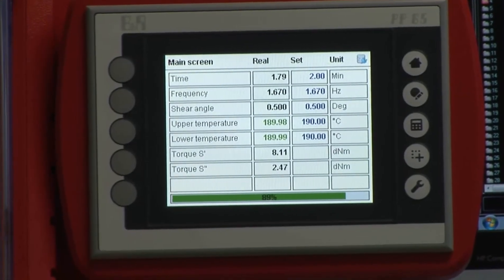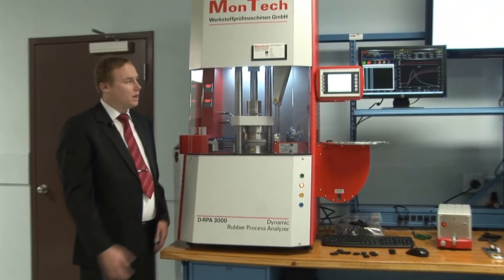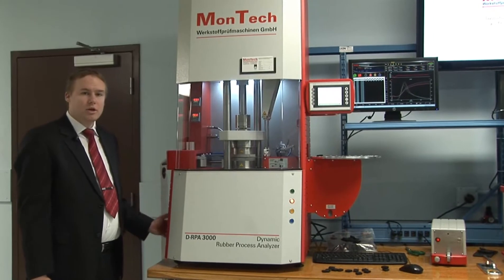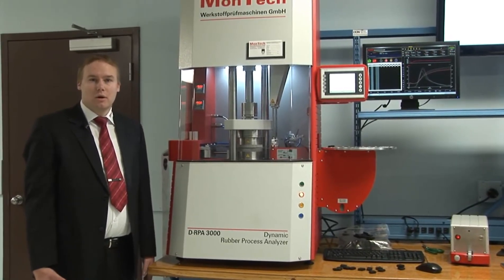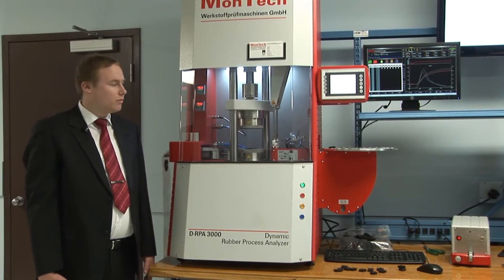The instrument itself is fitted with an Ethernet interface, so you can set up the computer in the lab and still have the machine in your production environment. The machine frame itself is extremely rugged and also fanless, making it a reliable testing machine in your shop floor environment.